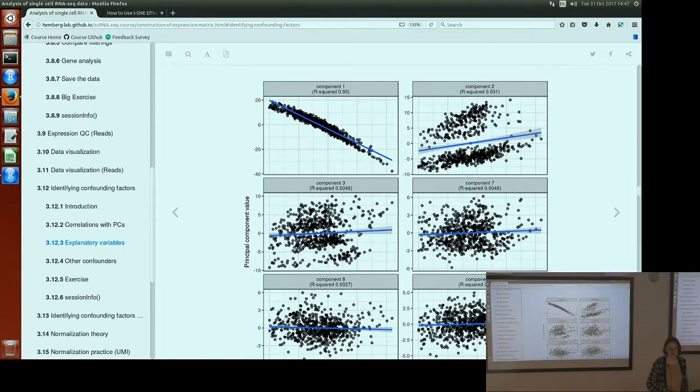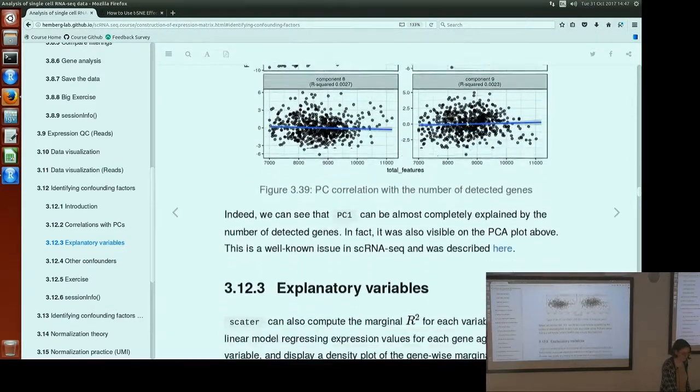Yes. What I mean is, is there a way to define it in terms of the names of genes, getting the loadings for the principal components out? No, there isn't a way of extracting the loadings from Scater.